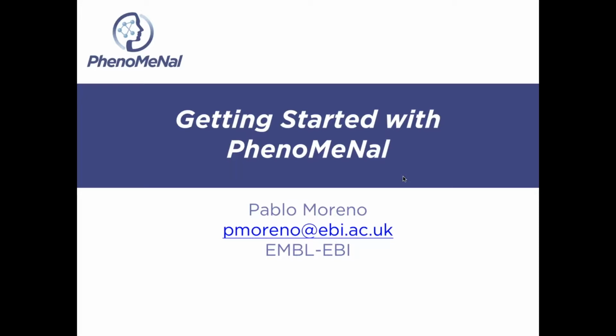So now we will go on with the slides for the PhenoMeNal overview part. To start with, we will go through this presentation first to understand a bit what cloud computing is, as it's an integral part of PhenoMeNal. PhenoMeNal is a project that is envisioned to allow people to do metabolomics data analysis on the cloud. And then after that part, I will give an overview of the main components of PhenoMeNal, and I will explain how they interact to be able to provide the functionality that I mentioned before.